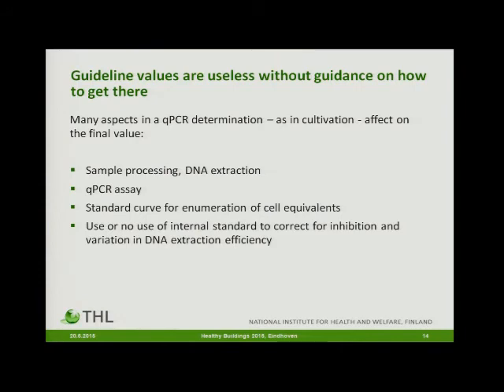Sample processing, that's the same for any method. And DNA extraction, qPCR assay: there's a bunch of different assays out there that measure total fungi, and you can be pretty sure that whatever assay you use, you're going to get a different number. Standard curves are an important issue with qPCR assays, and I'm going to go there.